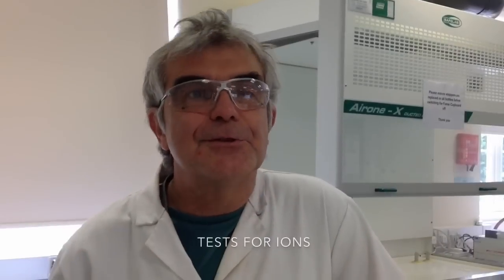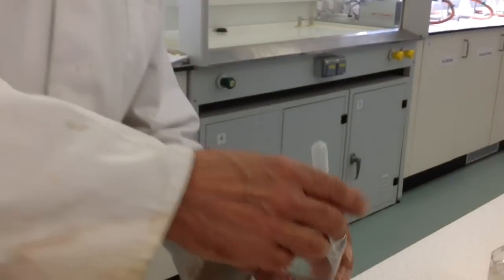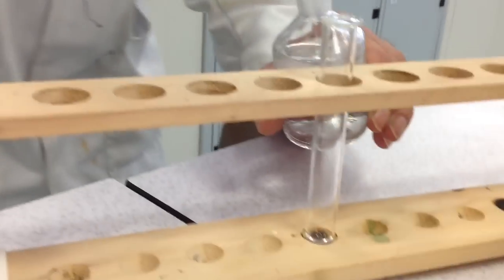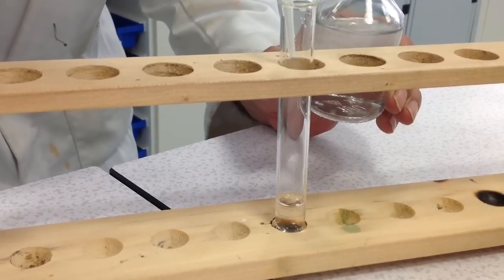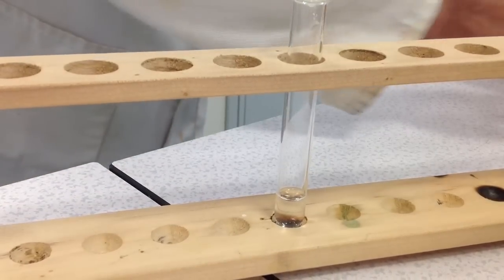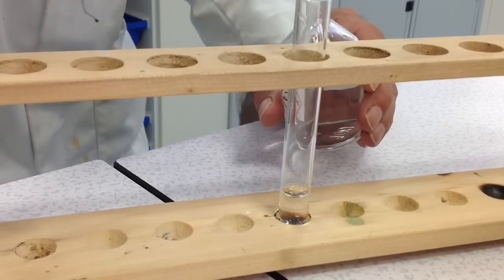Hello, today I'm going to show you some simple test tube reactions that you can use to identify various different ions. First of all, we are going to identify the carbonate ion. So I'm going to add a carbonate solution to a test tube. I'm going to add an equal volume of dilute acid, in this case nitric acid, to a test tube as well.